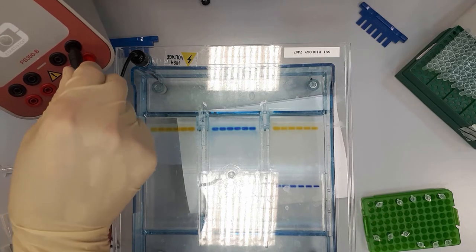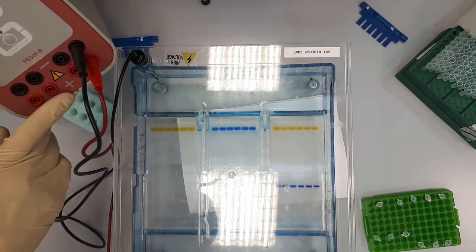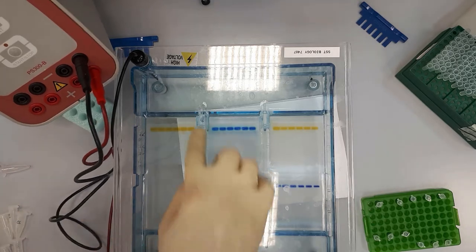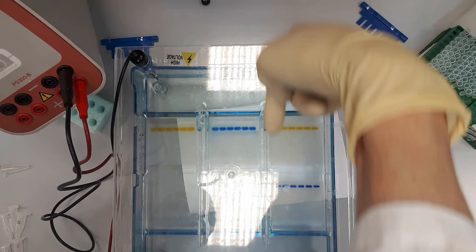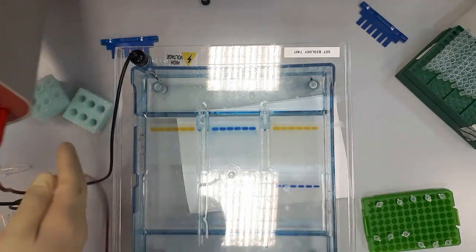The explanation of these colors is here: negative and positive. The top would be negative because the DNA is negative and it will move towards the positive pole.